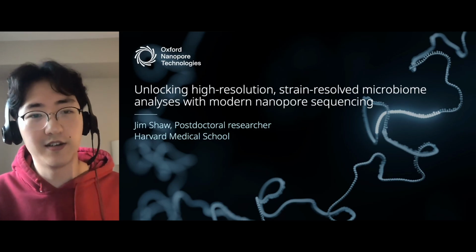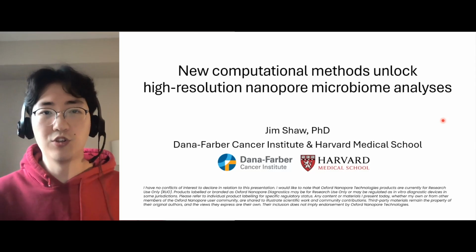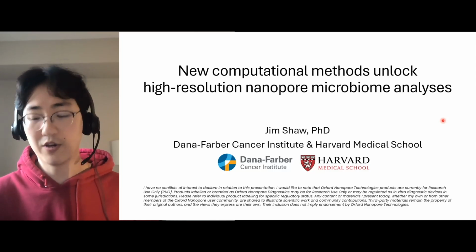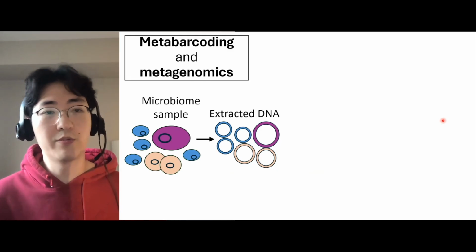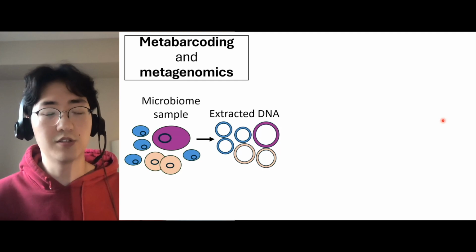I'm a postdoc at Dana-Farber Cancer Institute in Harvard Medical School, and I'll be talking to you today about how new computational methods can unlock high-resolution nanopore microbiome-based analyses. So today I'll be talking about microbiome analysis, such as metabarcoding and metagenomics. So the picture looks like this.